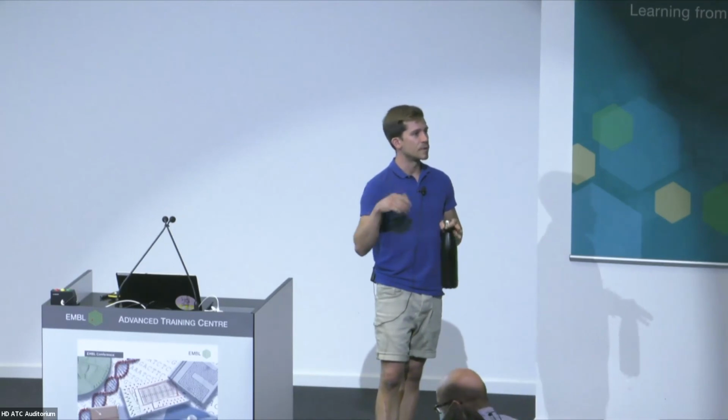Thank you. So just to clarify on that, so you don't have peristaltic motions. So we do have some of our designs with the side chambers, and we can apply vacuum and deform them. We've done that, but we didn't find any benefit in doing that, and we stopped because it was adding complexity to the system that we are not looking into.